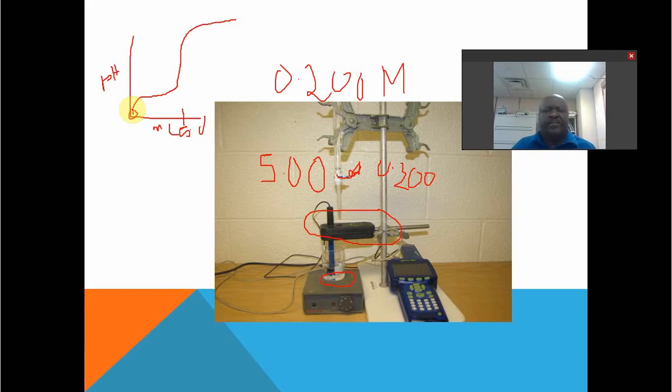Talking concentrations here, obviously. Now, if I'm adding base, then as I add, when I get to here, some of the HA is going to A minus. So I then have a mixture with known values of HA and A minus. So for this region here, I use the Henderson-Hasselbalch equation: pH is equal to pKa plus log A minus over HA, you know the story. And so halfway here, the HA and the A minus have the same concentration.